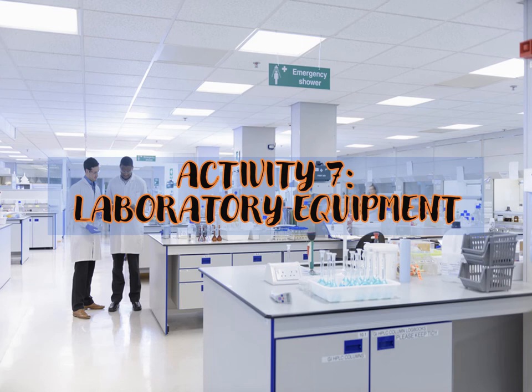Hi everyone! Welcome to Activity 7. Today we are going to talk about the different laboratory equipment. Although we have come across some of them in our previous lessons like the biosafety cabinet and the fume hood, today we'll look deeper into the other laboratory equipment used by medical technologists. The type of equipment required in a medical laboratory is determined by the size of the lab and the number and variety of tests performed.